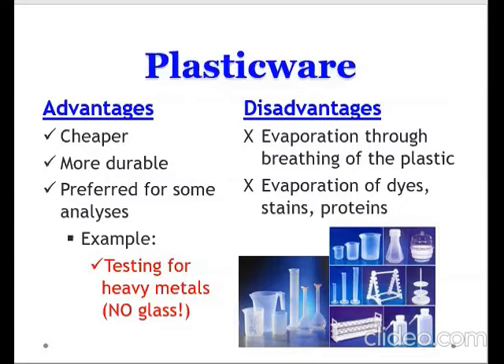The reason behind that is what we call polymer permeability. Okay, it's what we call polymer permeability. So, sir, what is polymer permeability? Actually, the concept of polymer permeability is similar to the concept of the cell membrane.